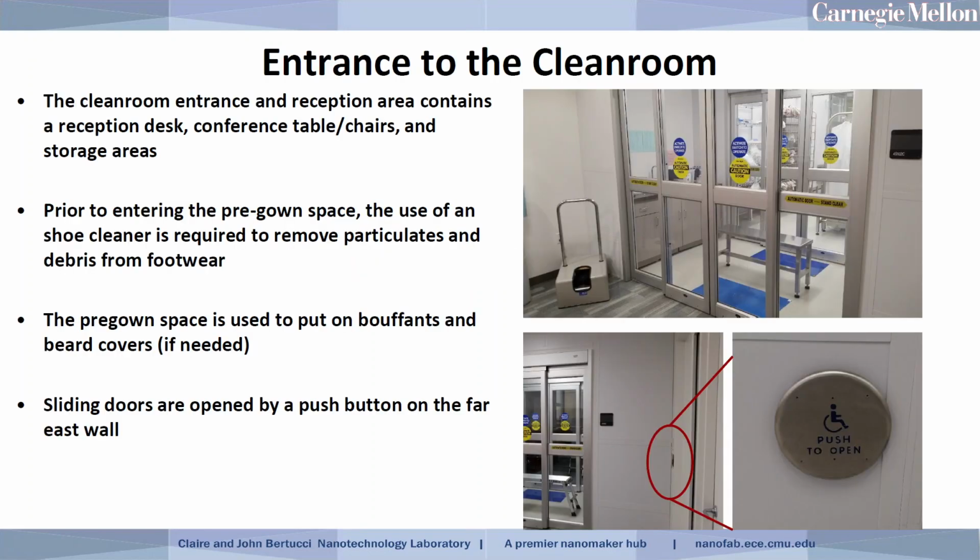Okay, so our virtual tour here starts out in the cafe area. Once you enter the reception area, you'll see a reception desk, a conference table in that area, some storage in that area. So the first thing that you'll do once you arrive would be to use the shoe cleaner here.